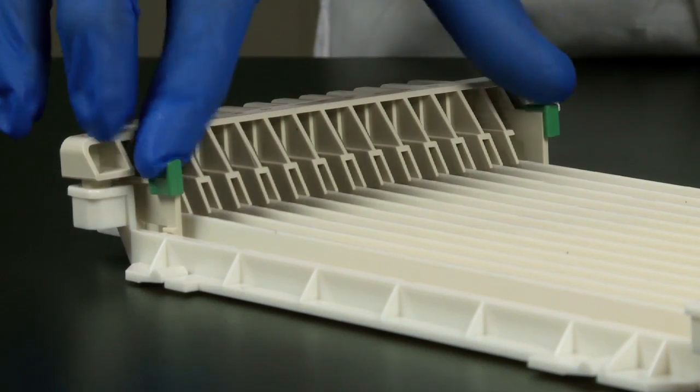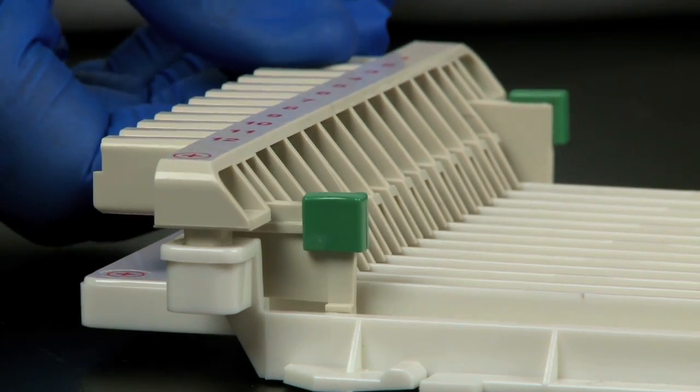Press the electrode assembly straight down into the tray by pressing on the green tabs until you hear a click.